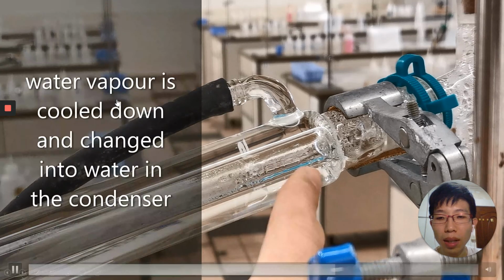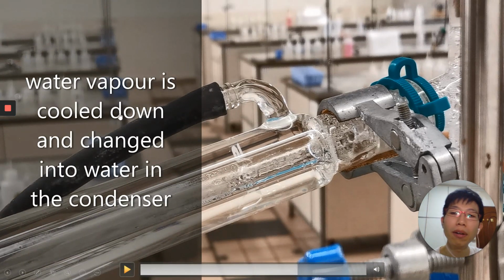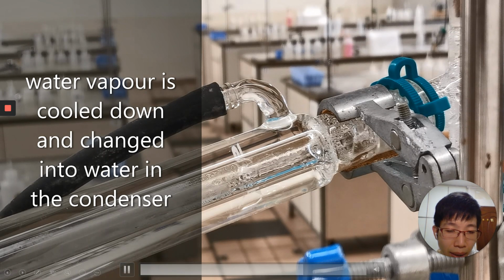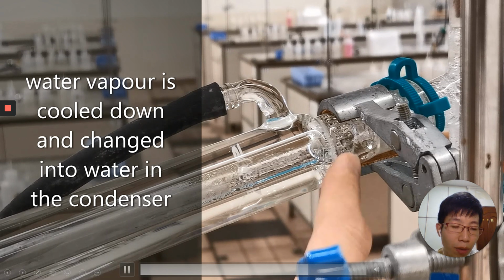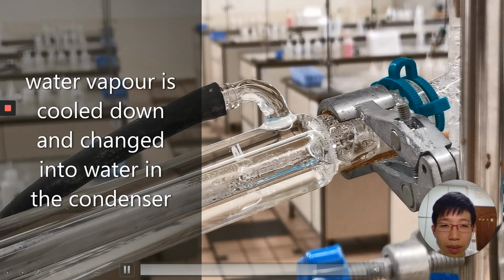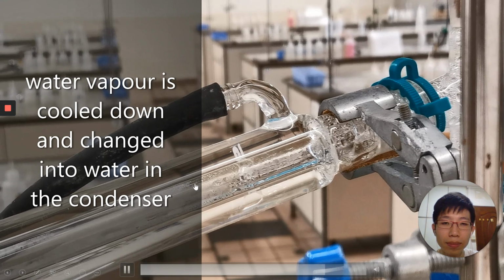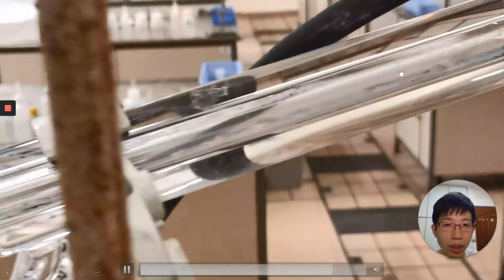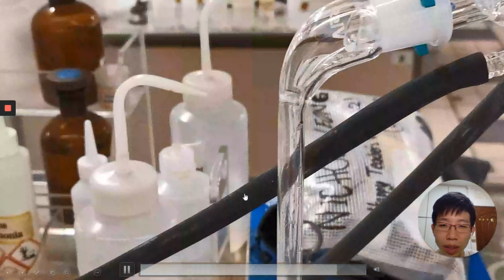And in this part of the video, water vapor is being cooled down and changed into water in the condenser, as you can see in this part over here. So let's focus on this region. See, there is some water being condensed. As time goes by, more and more water vapor is being condensed, and will flow down this condenser as it is tilted. See, some water is flowing down the condenser.